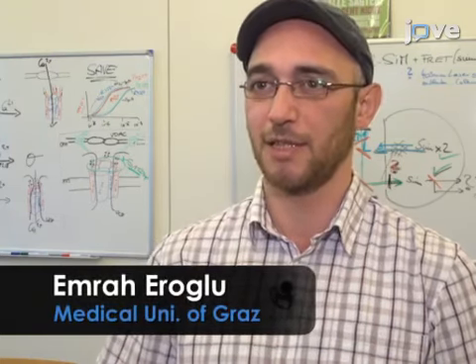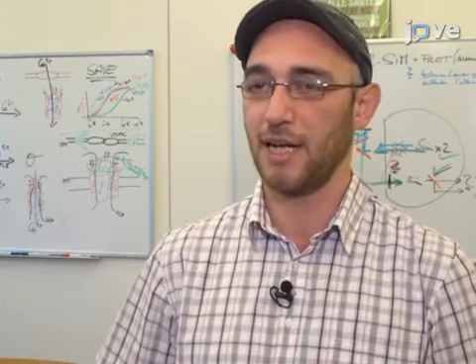We visualize the nitric oxide signals with novel, rather simple-built fluorescent protein-based probes, the geNOps. The geNOps respond directly and immediately to nitric oxide by fluorescence quench. This means you can monitor the real-time kinetics of the generation, diffusion and degradation of nitric oxide in single cells. The main advantage of geNOps is that you actually can look at nitric oxide signals with high spatial and temporal resolution using a conventional fluorescence microscope.